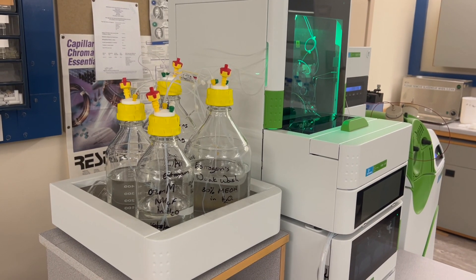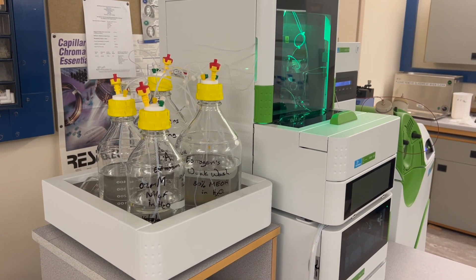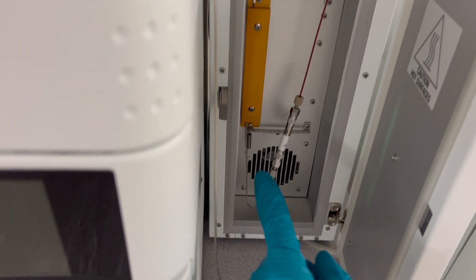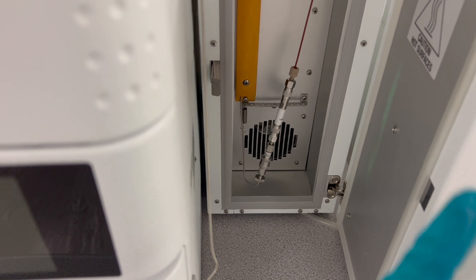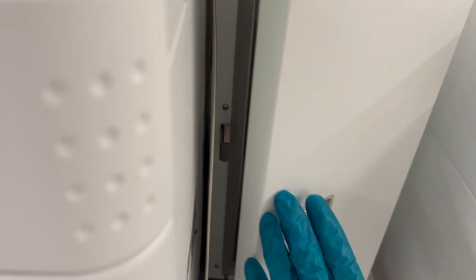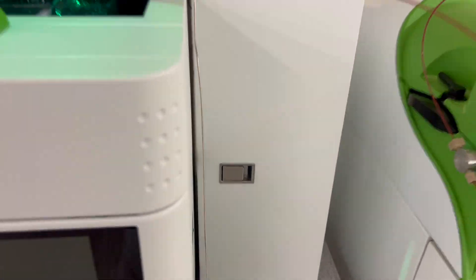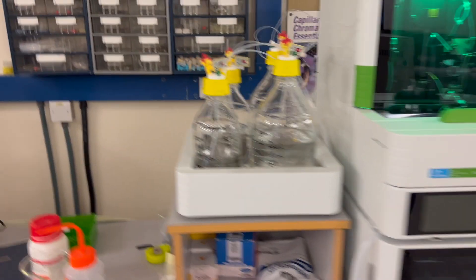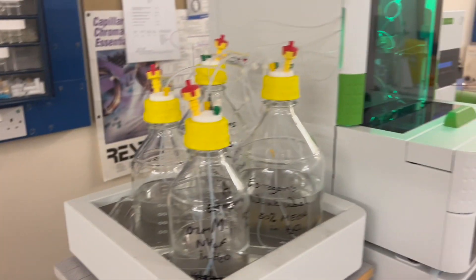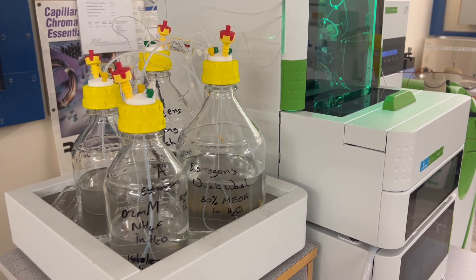My first stage in preparing the LC-MS is that I need to run acetonitrile through the column. The column is in here. I am going to remove this column and change it to another one, and I want to store it in acetonitrile because that helps to keep the column healthy while it's in storage. So I'm just going to change over one of these mobile phase bottles to acetonitrile and run 100% of that through the column for about 10 to 15 minutes.